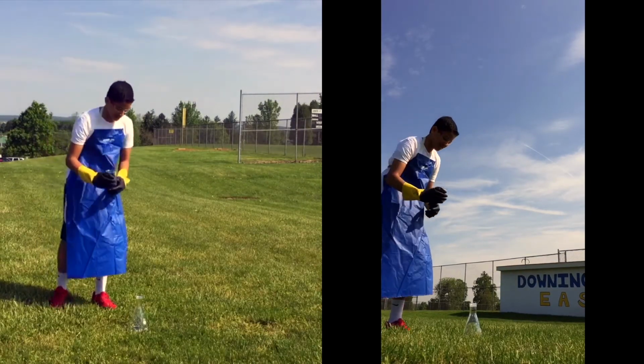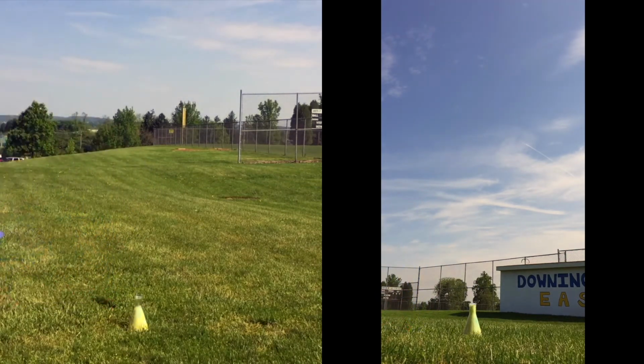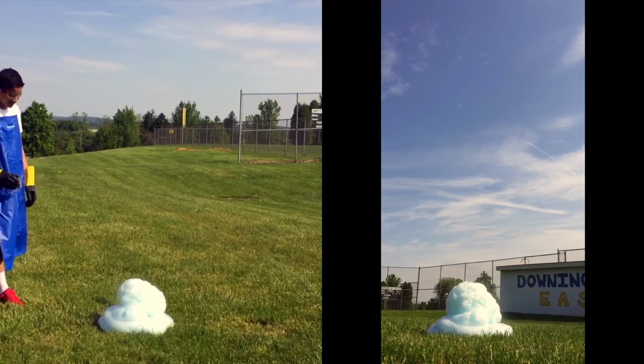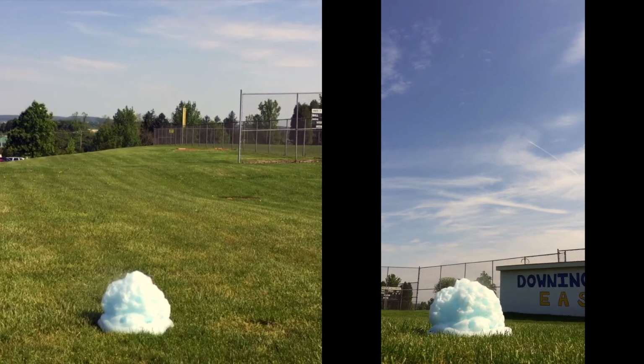Alright, we're ready to go. That was better. That was way better. It's still going. That's actually safe. That's way better. It was because of that yeast. Yeah, the yeast, man. If it was fresh yeast, that would have exploded. I actually thought it was going to explode when it first started. It's gonna blow on you guys.